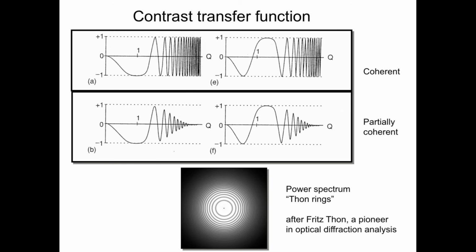Now, why do we see this at all? This is because we're looking at a Fourier transform of an amorphous object, and a Fourier transform of an amorphous object contains Fourier components everywhere without any gap. So that's almost like an illumination in Fourier space, and this here sort of is a mask that is on top.